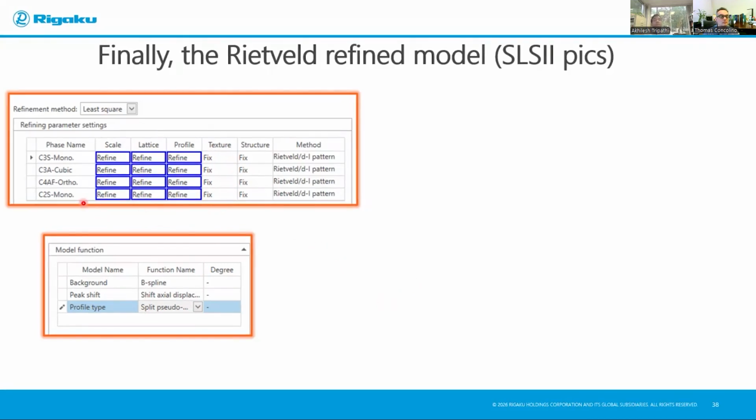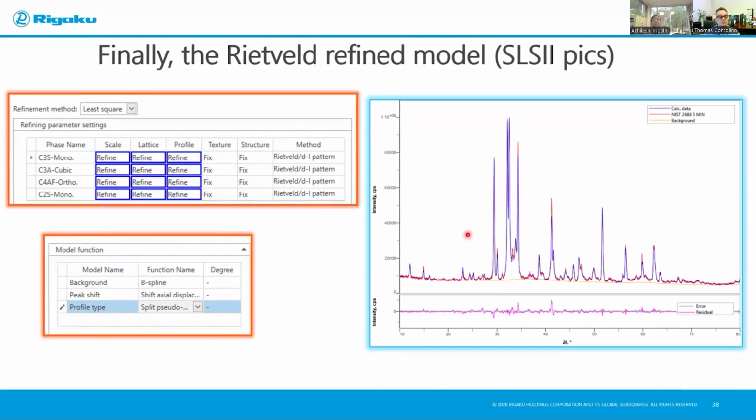And if you don't have the crystal structure, this will automatically be doing something called Pawley or LeBail fit. And then you will fit your pattern. The blue one is here, the calculated data or the model, and red is your real data, and the differences are minimized. And one way to quickly look at it is my difference pattern. Are there still quite a bit of differences, like in this one? So you will go back and see, is there a preferred orientation here? Is it the right phase? A number of things you can go back and forth and fix to get the model almost matching the real data.